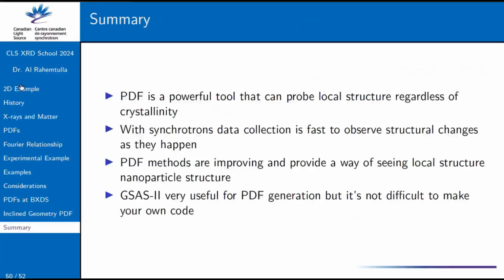So to sum up, the PDF is a very useful tool, especially when we want to probe local order and structure. And we can see there's information on local ordering regardless of whether we have crystallinity or not. It's either going to show up as a lot of Bragg peaks, or we're going to see some form of long-range oscillation throughout your pattern. This is a method that is fairly critical for synchrotrons due to the higher energy you need to even theoretically access higher angles, which is great for us as a synchrotron.